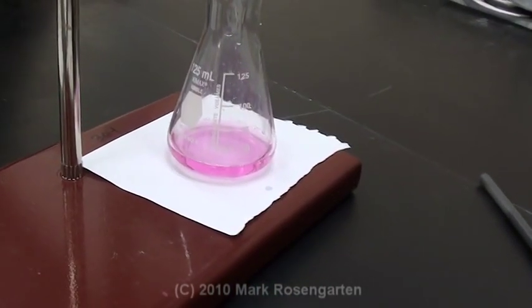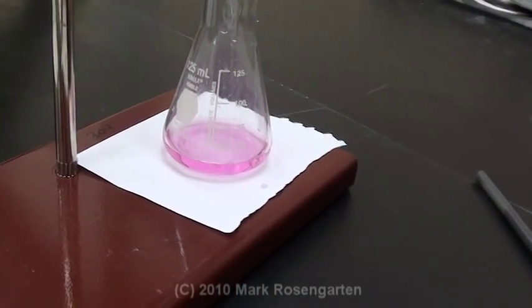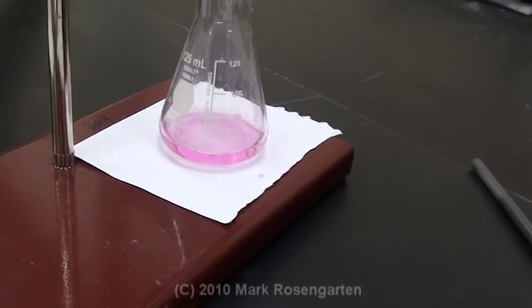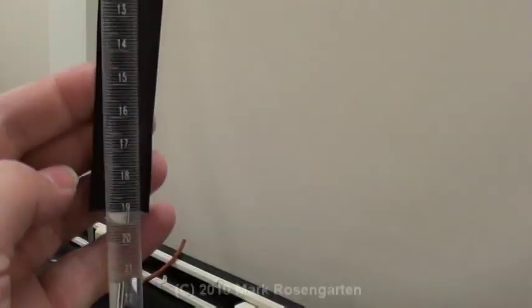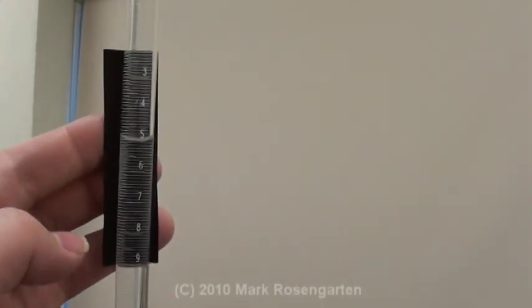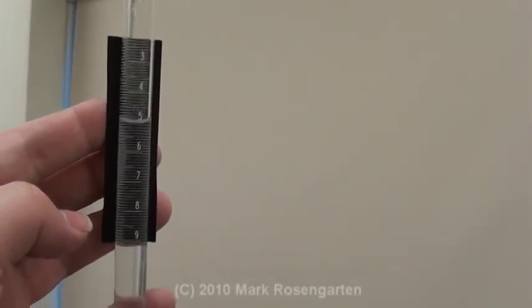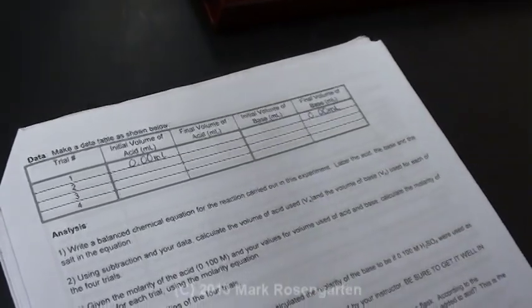Now that you've got the correct color, you know your solution has been neutralized. So now you're going to use the black piece of paper and you're going to hold it up so that you can more easily read the level of the liquid in the burette. And then record your data for trial one.